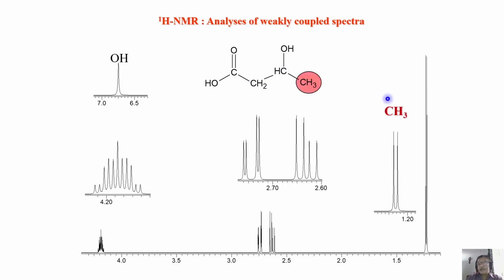Fine. Now I will say that is CH3, and this same doublet is expanded here to make it clear for you. So it is a doublet. That's what is clear. Next, we will go to the other thing.